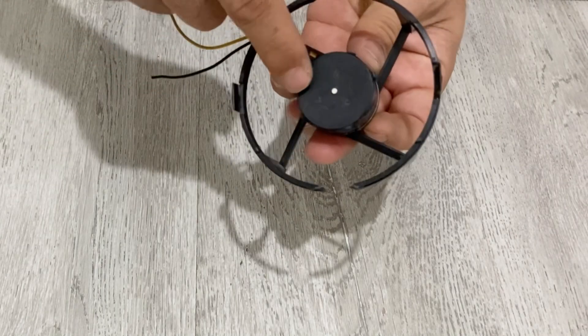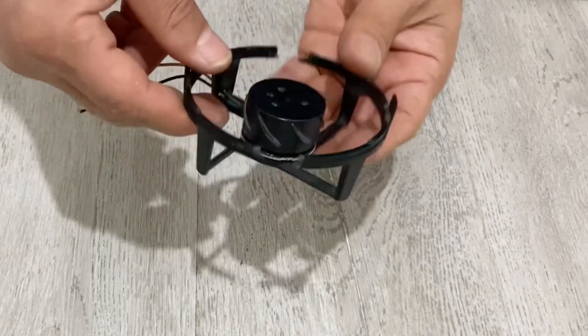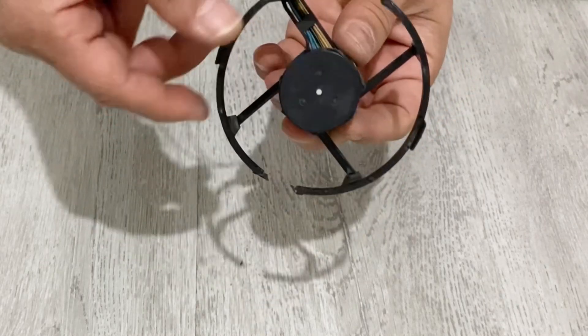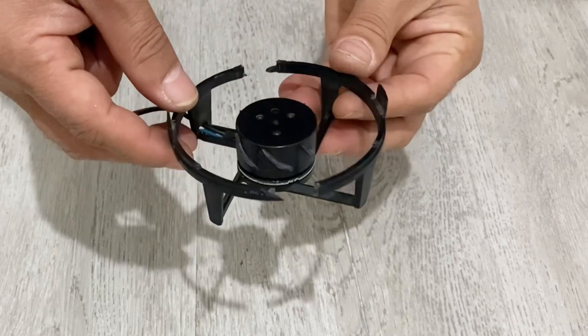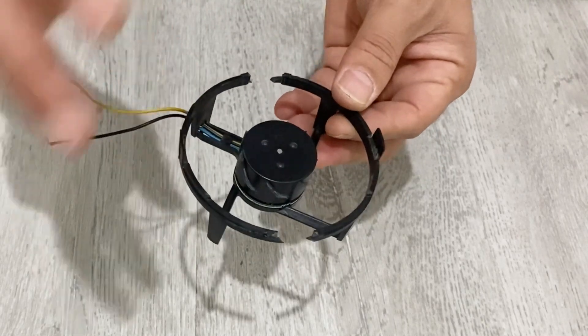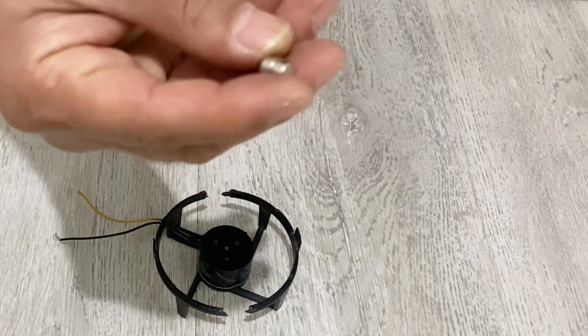First of all, I need a cooler fan. As you can see, I just slipped off the blades of the DC motor. This type and form of the DC motor will be very useful for us to make our magnetic stirrer.